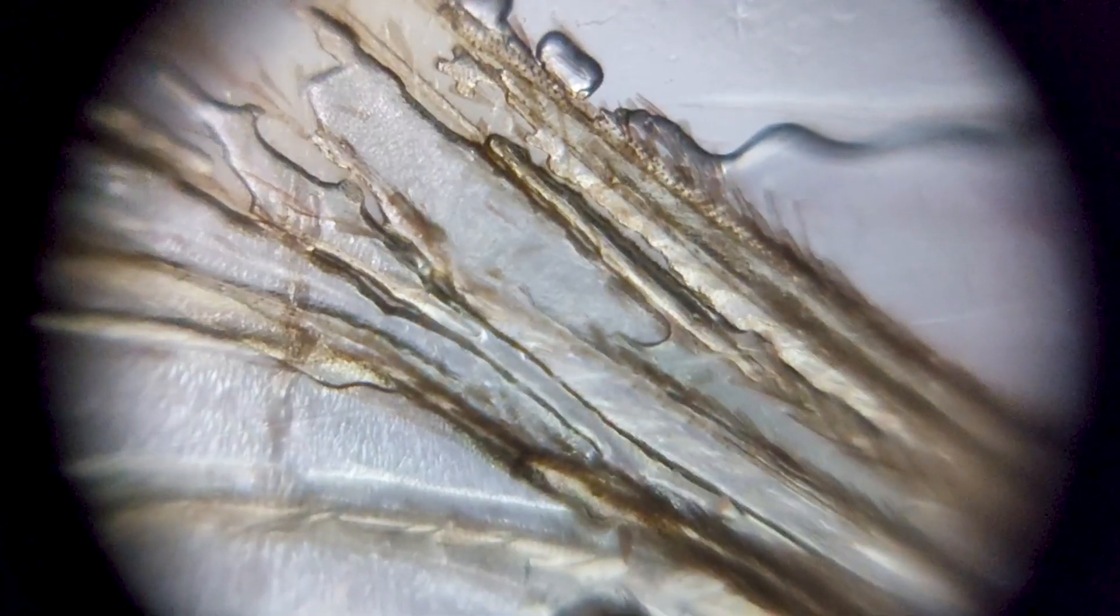Now let's go to the thorax area where the wings are connected. If you look at it, the wings are connected. And this section is also connected to the legs. The wings are connected to the thorax area. This is the upper thorax area.